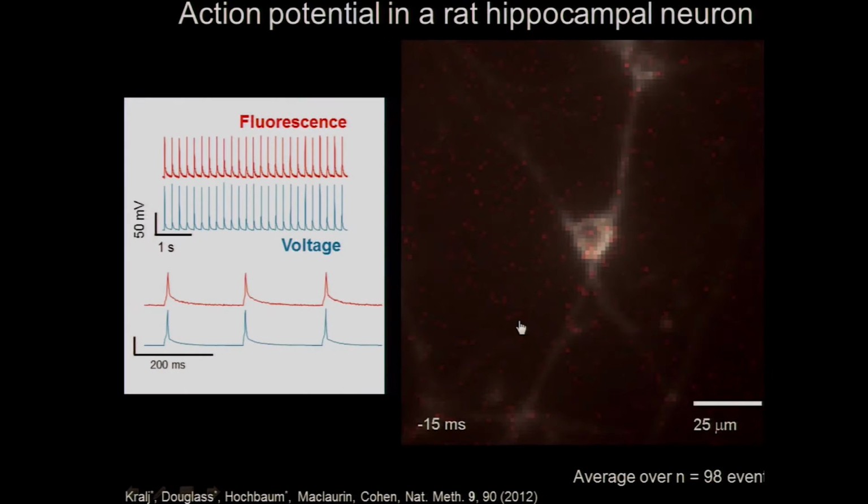Because we're doing this in a microscope, we can take videos of what these action potentials look like. So here is a neuron, and you can't see it, but there's a little patch pipette jammed into the cell. And I'll show you a movie at 1,000 frames a second of what an action potential looks like in a neuron. This is averaged over about 100 repetitions of the stimulus to improve the signal to noise. Right. So that's what a neuron looks like when it fires.